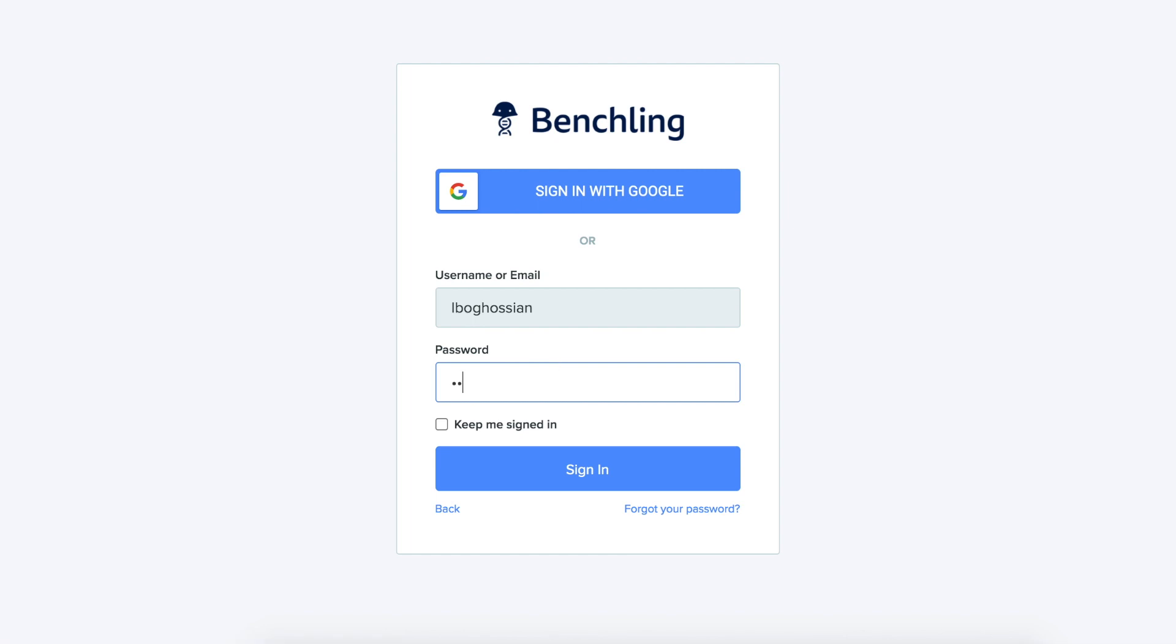This tutorial will teach you how to use the software Benchling. First, sign in to your account or create a new account.